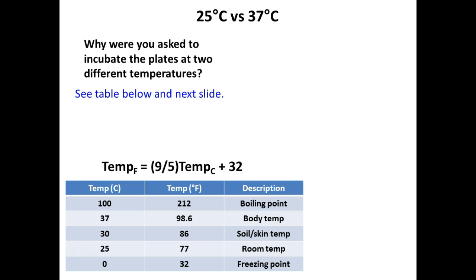It'll get nice and smelly and stinky. And again, the reason why it's set at 37 degrees Celsius is that it's equivalent to around 98.6 degrees Fahrenheit, core body temperature. Nice and toasty warm. Keeps our bugs nice and happy.